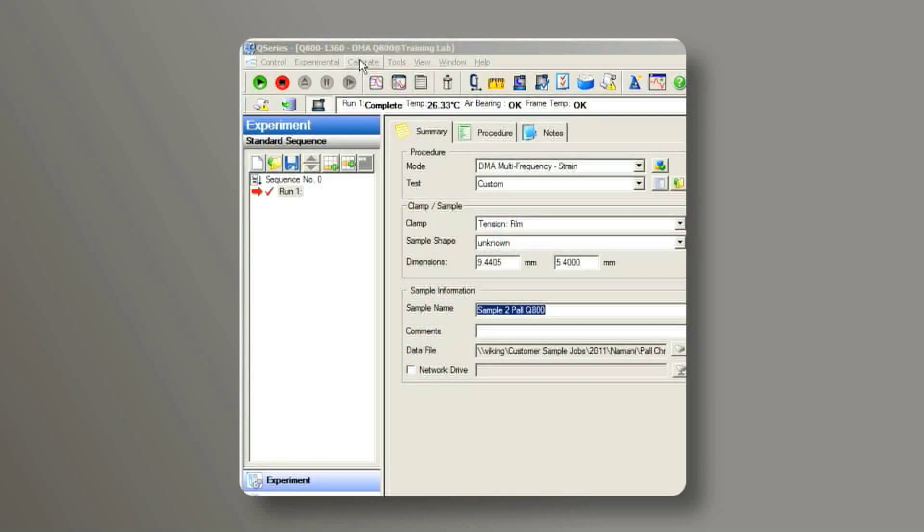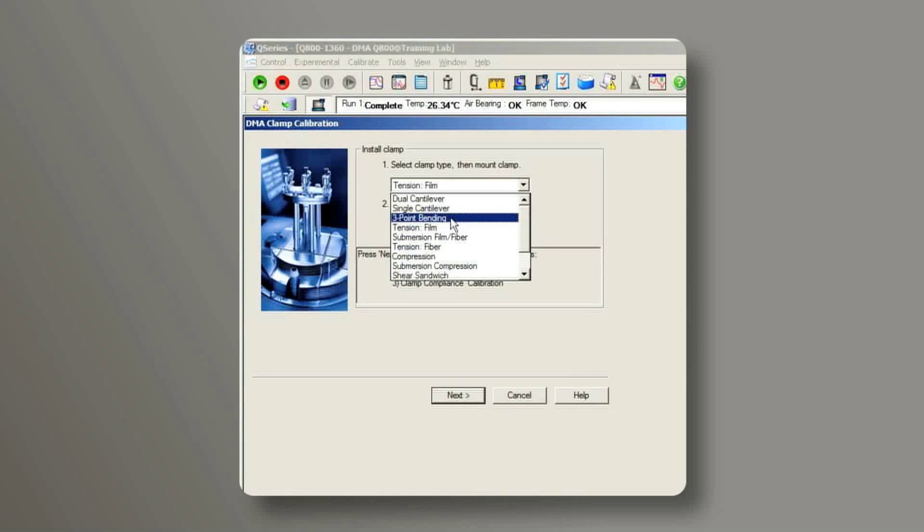From the control software, go to Calibrate Clamp, choose 3-Point Bending, All Calibrations, then Next.